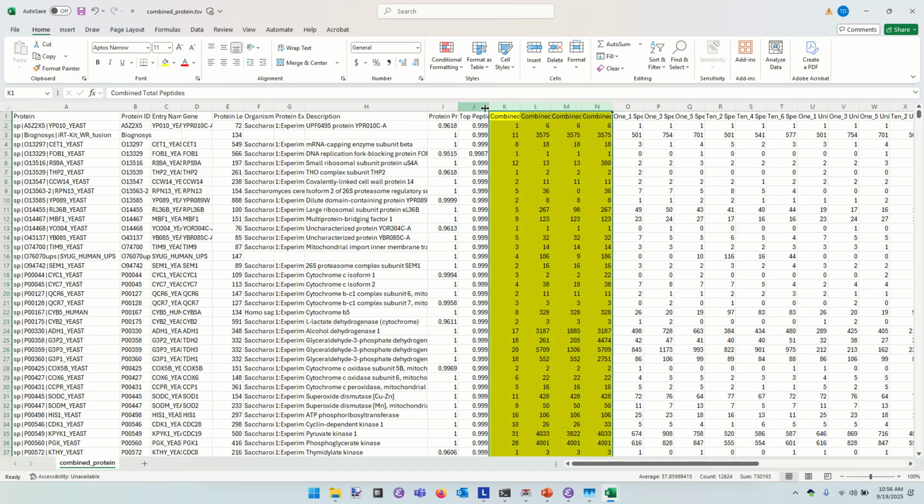All right, so the combined stuff is saying en masse, if we put all 6 of these raw files together, how many spectra do we have, how many peptides do we have, and so on. But what we're probably interested in is knowing how our 3-on-3 comparison did. So we have spectral counts here, and I would say spectral counts are a nice quality check on things.